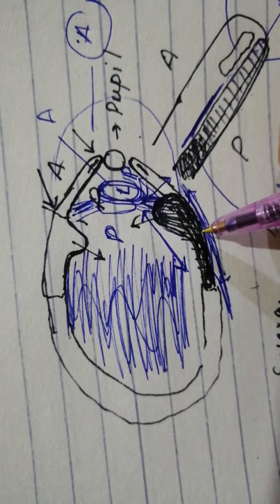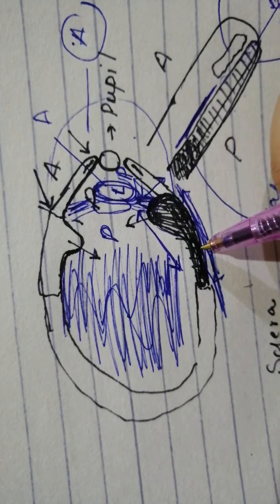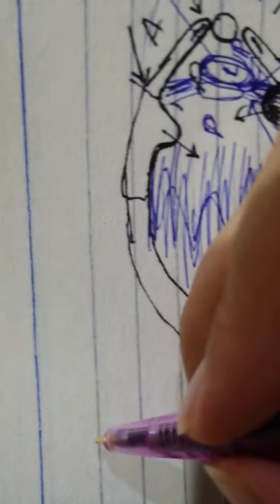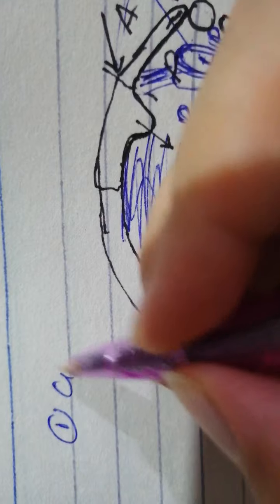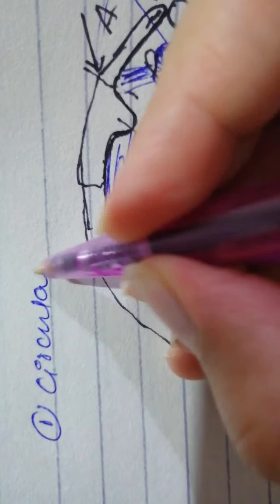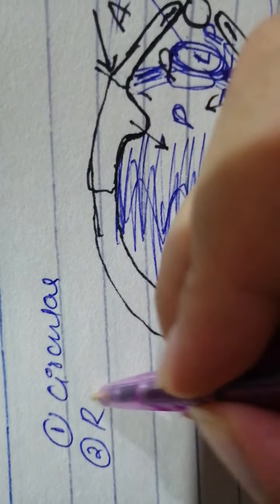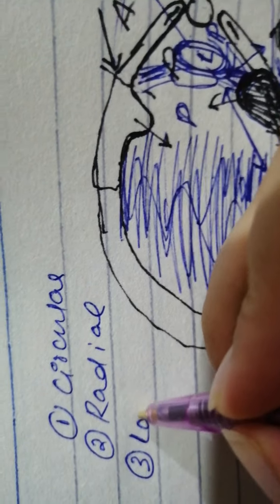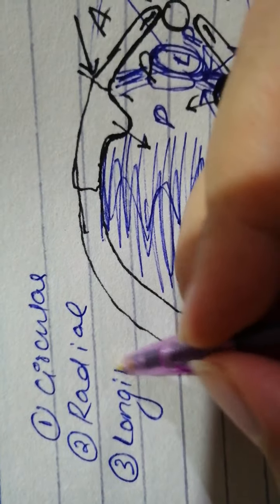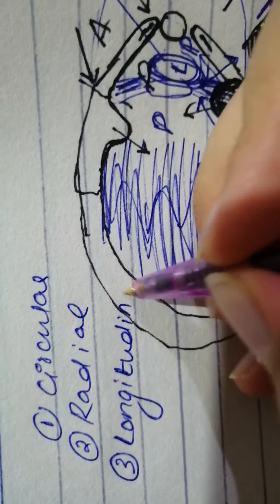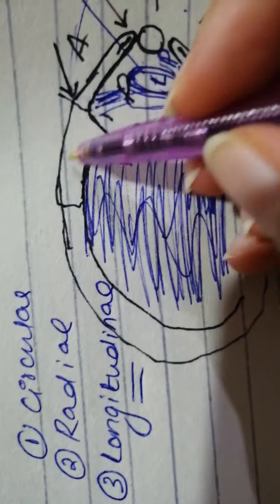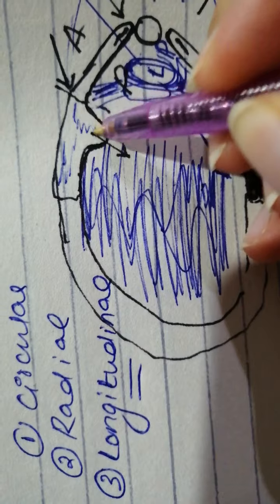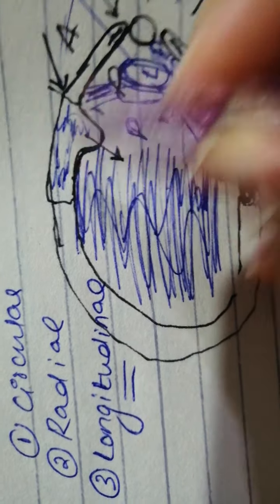The ciliary body is again it's mostly muscle and the muscles are in three arrangements. Circular, radial and longitudinal arrangement. And you can kind of show it all over the place like this.